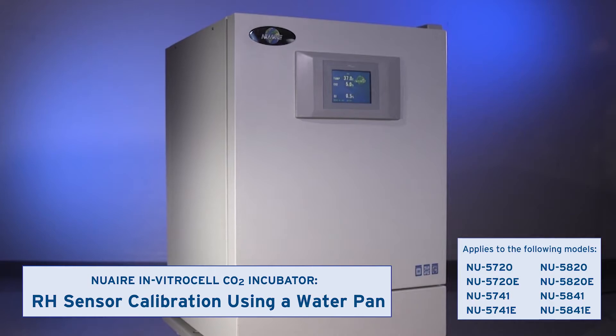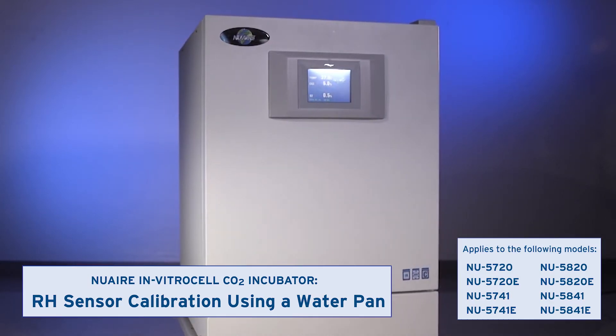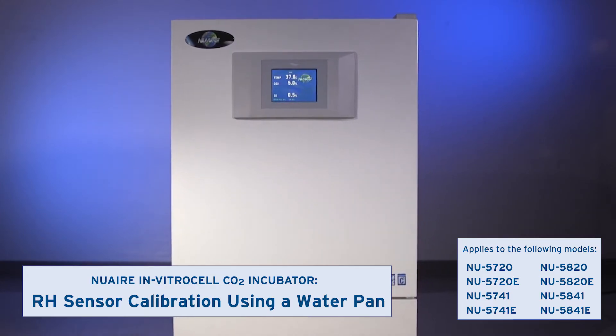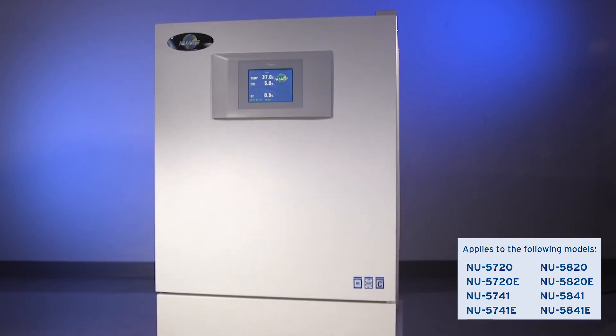This video shows how to calibrate the RH sensor in incubators with active humidity control by using the water pan included for this purpose. You may choose to calibrate it during installation and are advised to calibrate it every six months thereafter, or as dictated by laboratory policy.